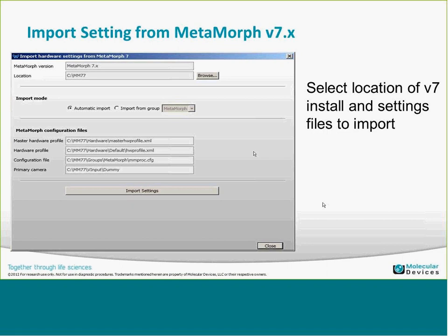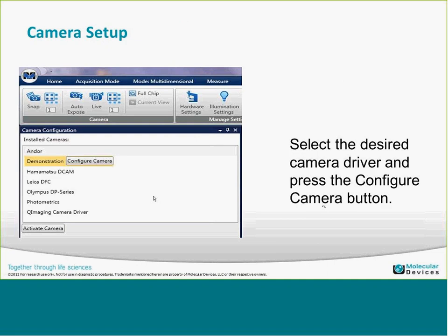If not, you can easily do this manually. The first thing to look at is Select Camera Setup, which opens the camera configuration pane with a list of available camera drivers. You highlight the driver you want to activate as the active camera, then click Configure Camera to bring up the dialog — the same camera configuration dialog you've seen in Metamorph for Olympus — with settings specific to that camera.